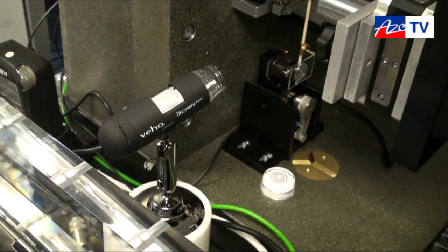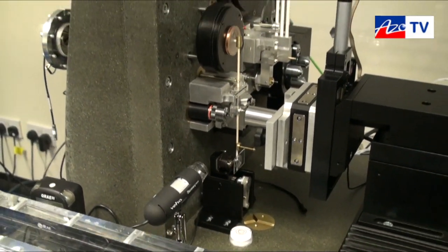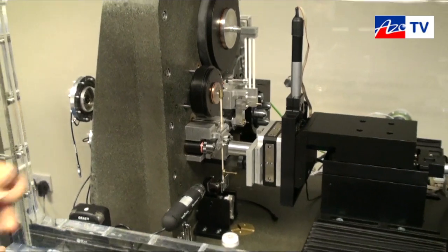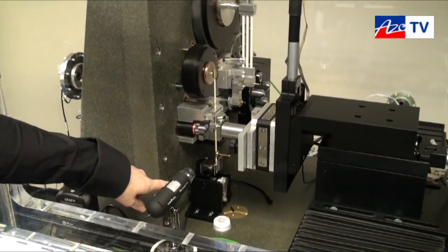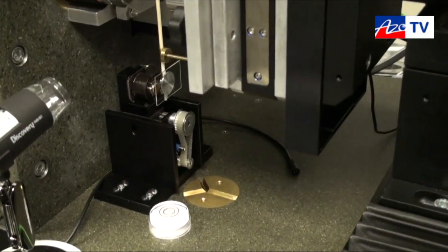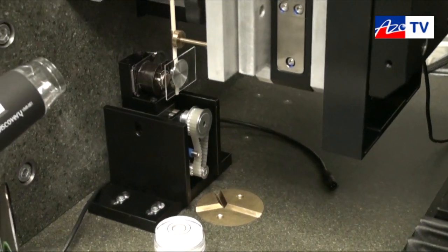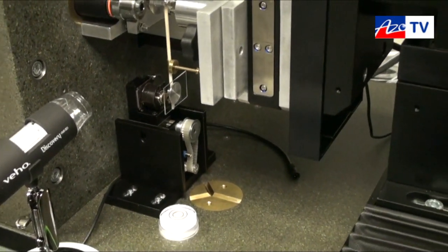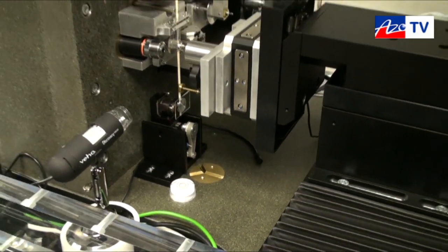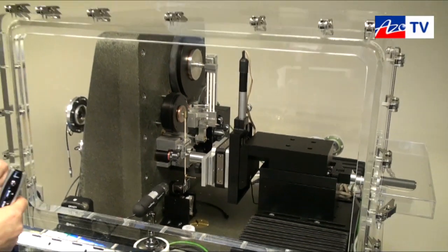Now this instrument here, I can tell by looking at it, it's configured for nano indentation, nano impact which is this solenoid construction at the bottom and also nano scratch. So nano indentation is for measurement of hardness, modulus, creep properties. Nano impact allows a very high strain rate test to be carried out in both single impact to look at dynamic hardness and repetitive impact to look at fracture and fatigue mechanisms.